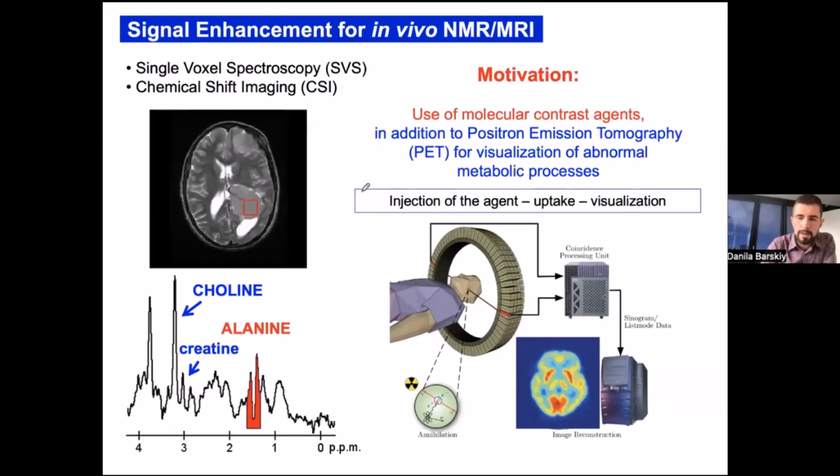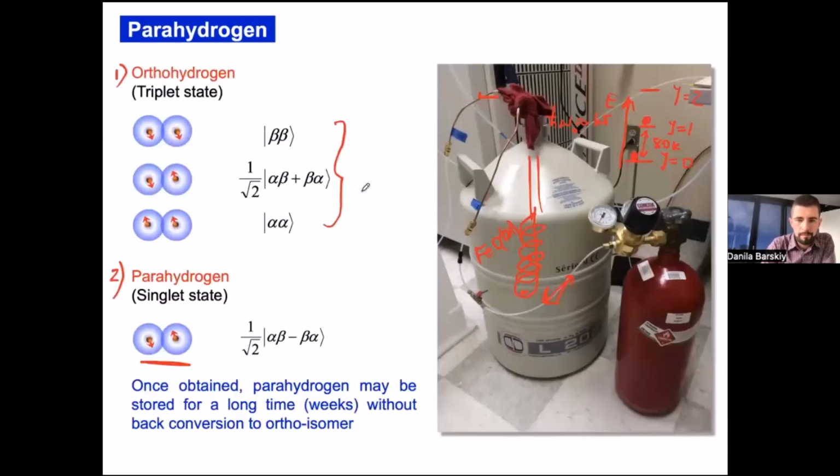So normally, what do we do? You actually can see the ortho-para ratio directly by using Raman spectroscopy, and that is done by some groups. You will see peaks associated with ortho and para hydrogen at different rotational levels, and by simply integrating them, you can analyze your ortho-para ratio. In fact, we have a simpler solution. We are just looking at NMR directly.